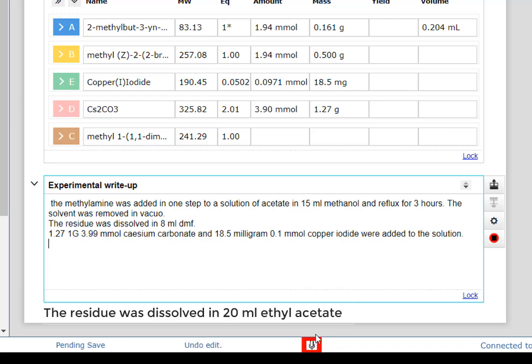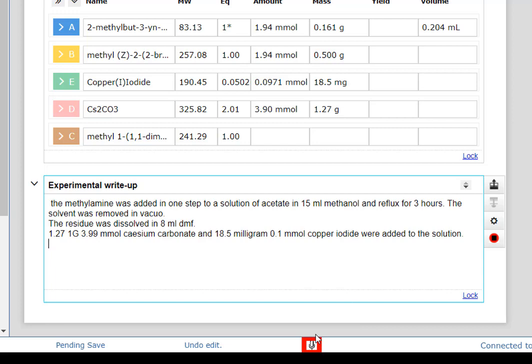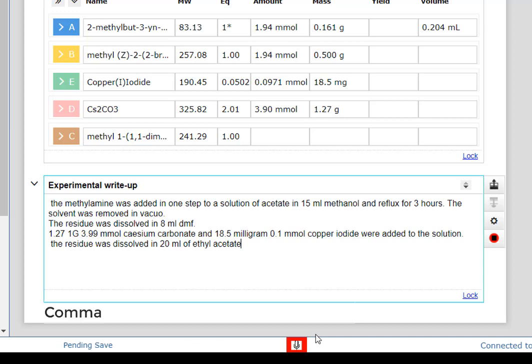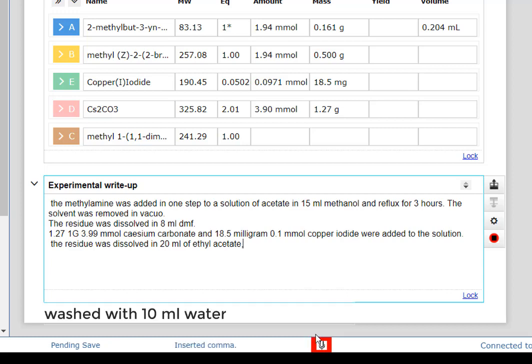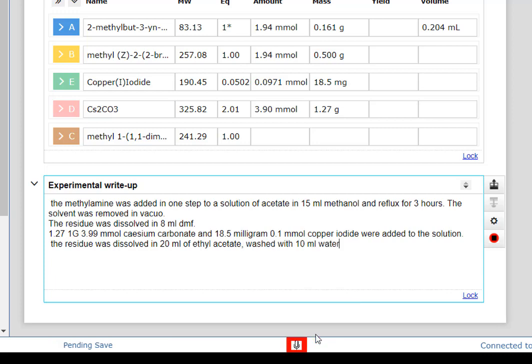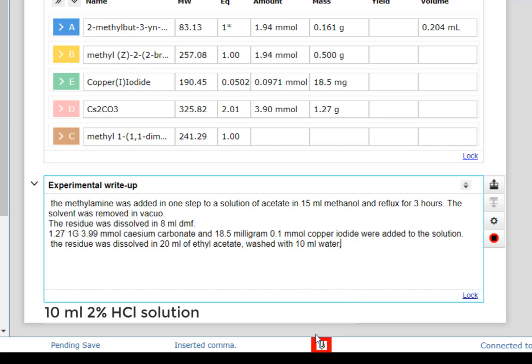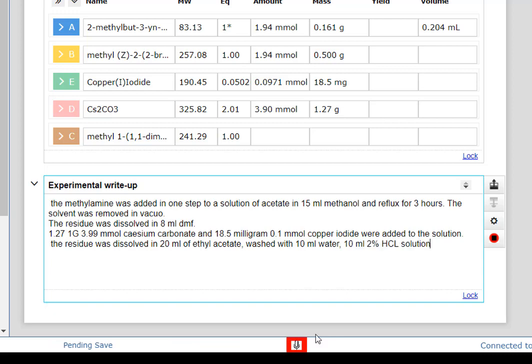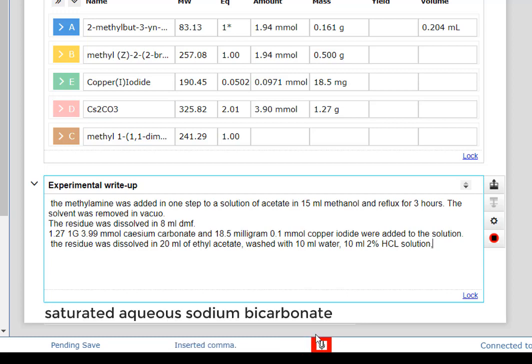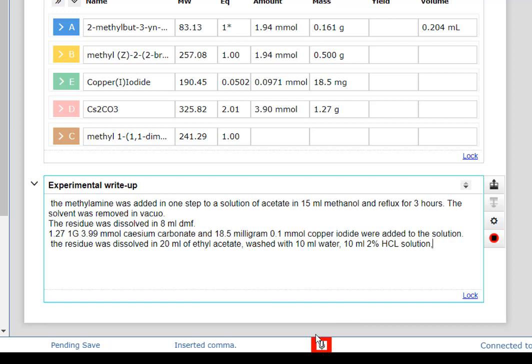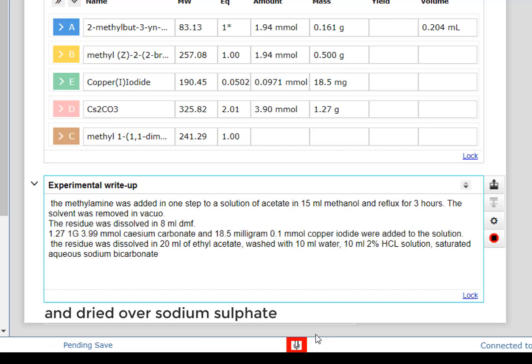The residue was dissolved in 20 mL ethyl acetate, washed with 10 mL water, 10 mL 2% HCl solution, saturated aqueous sodium bicarbonate, and dried over sodium sulfate.